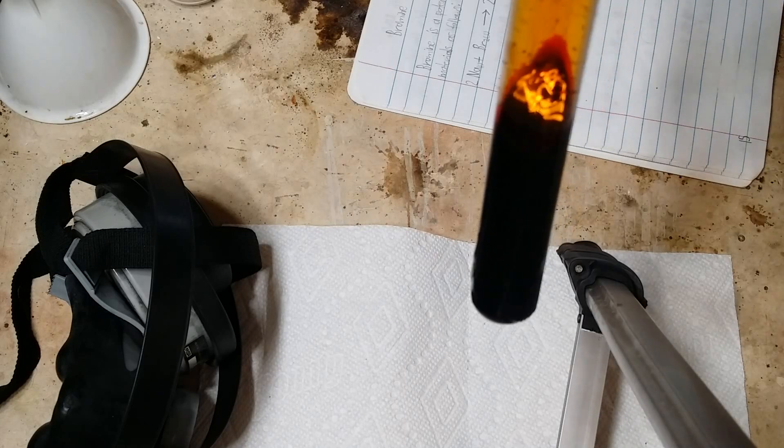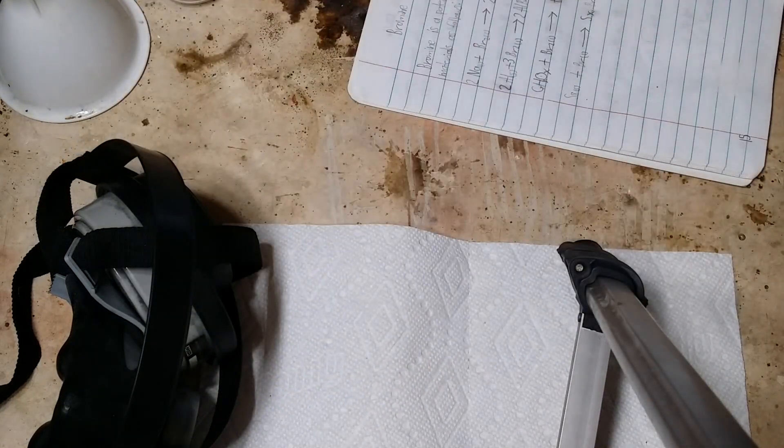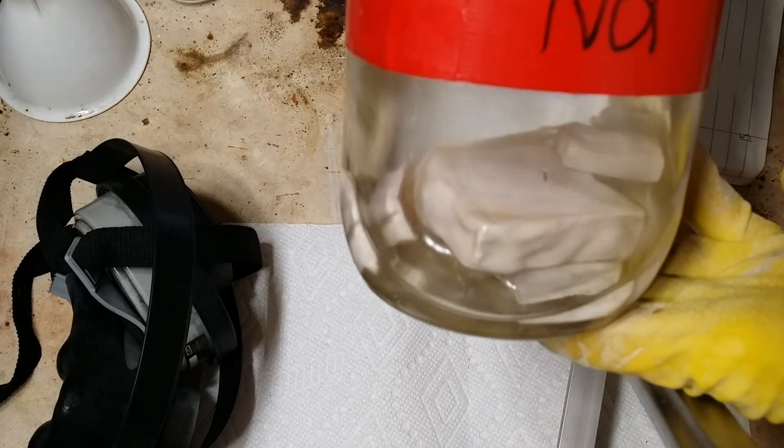Now I'm going to be reacting it with a few different materials today. I'm going to be reacting it with cellulose, aluminum, sulfur, isopropyl alcohol, and sodium metal.